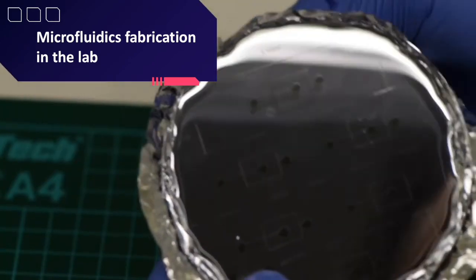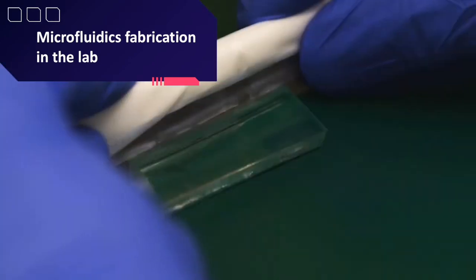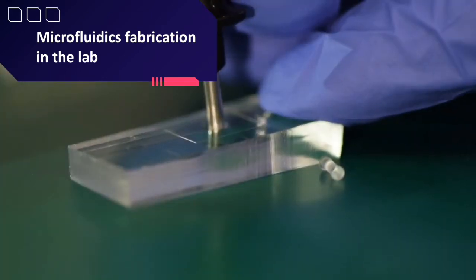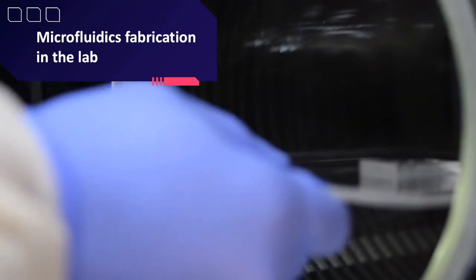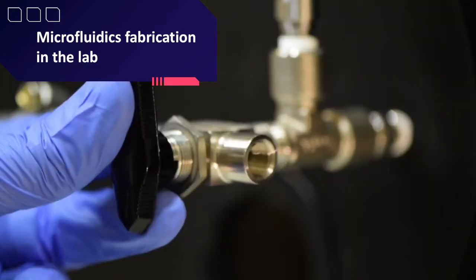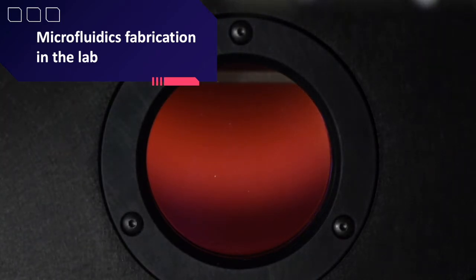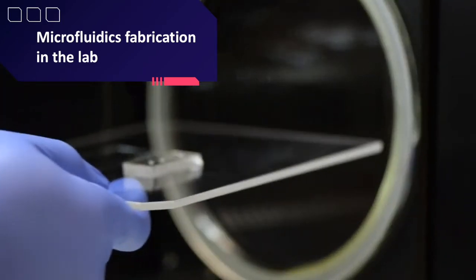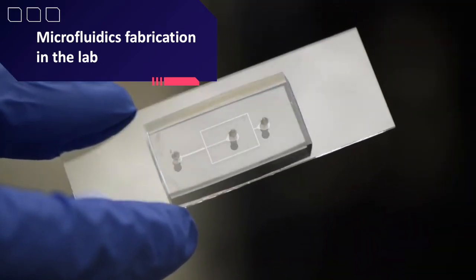We take away the aluminum and the mold and cut out of the PDMS the area around the circuit we want. Now we just need to make holes with a punch for the liquid's inlets and outlets. We're going to put the PDMS chip and a glass slide in an atmosphere of extremely energetic pure dioxygen. It will make every exposed surface very reactive. All it takes is putting the PDMS on the slide for chemical bonds to form. We've just made an irreversible bonding.